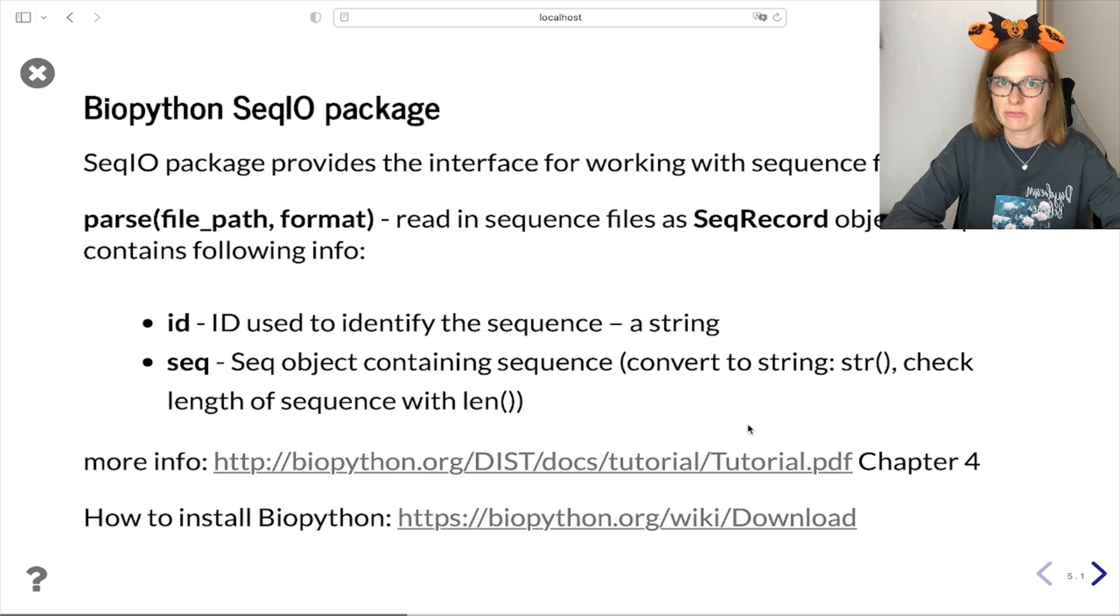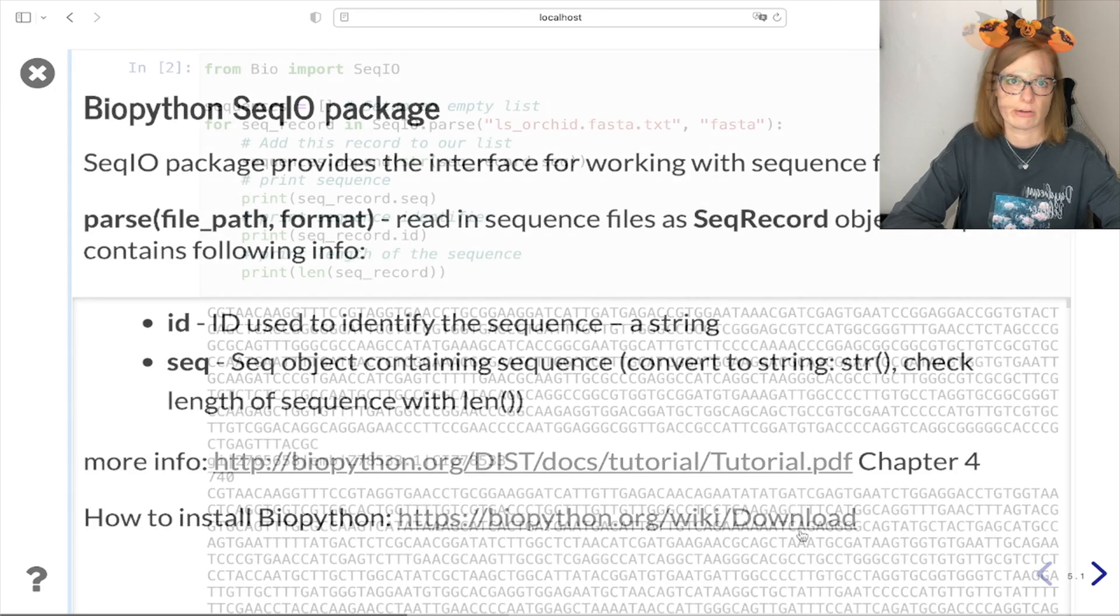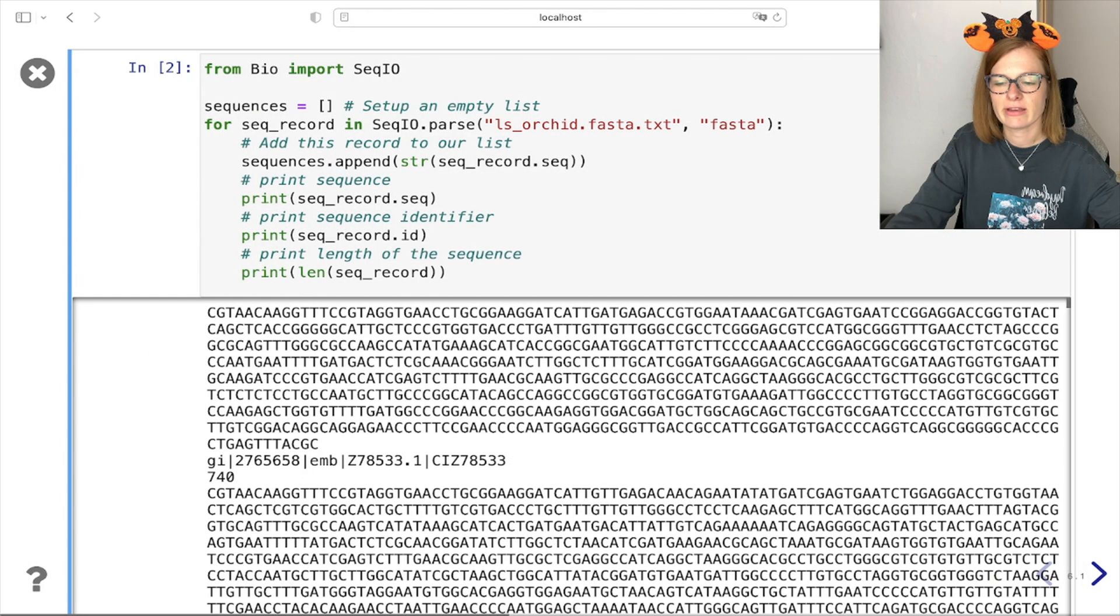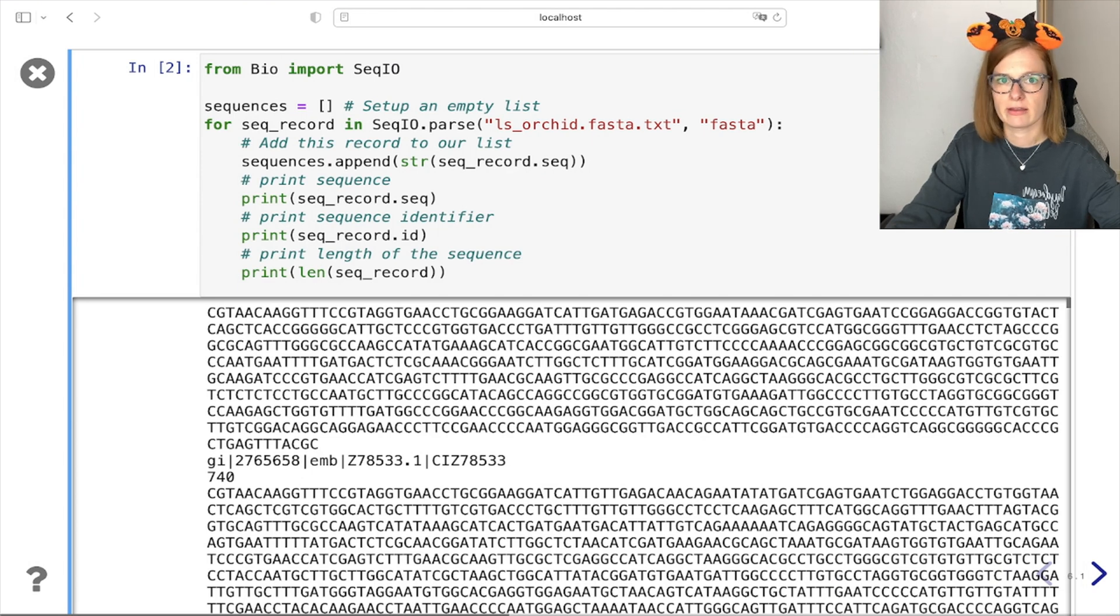Also if you are not familiar with how to install Biopython you can check it out on this link here. And here is the example of using parse function on our orchid sequence file.